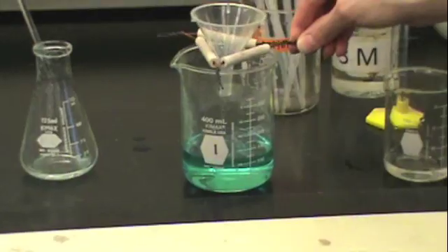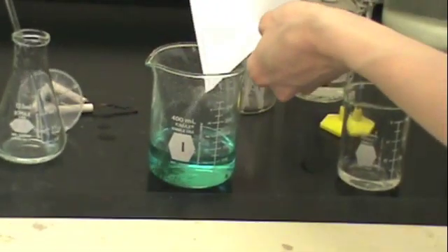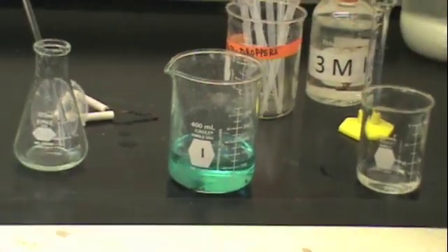In this video, we will demonstrate Part D of the Chemical Reactions Lab. You will need to add 80 milliliters of distilled water to your solution from Part C, then weigh out some zinc and add it directly to this beaker.